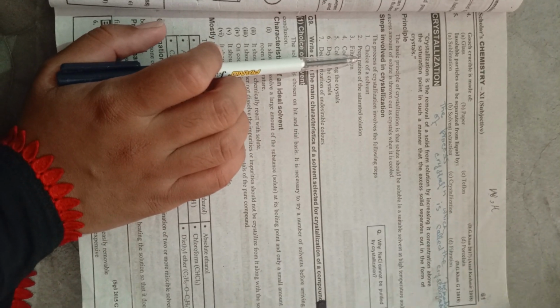Steps involved in crystallization. The process of crystallization involves the following steps: choice of a solvent, preparation of the saturated solution, third है filtration, cooling, collecting the crystals, drying the crystals, decolorization of the undesirable colors. आगे choice of solvent. Choice of solvent है, the solvent is chosen on a hit and trial basis. It is necessary to try a number of solvents before arriving at a conclusion.